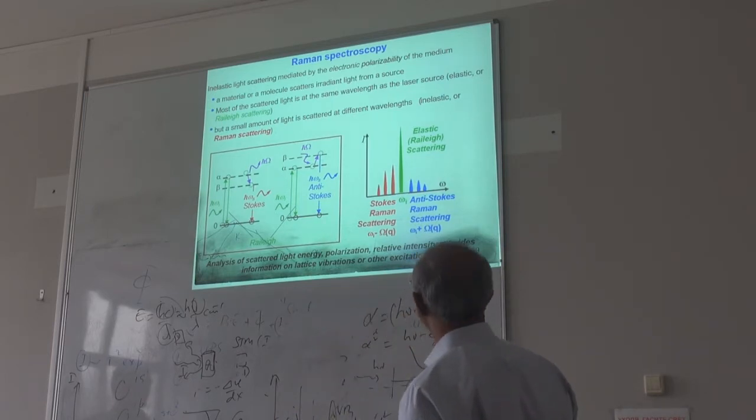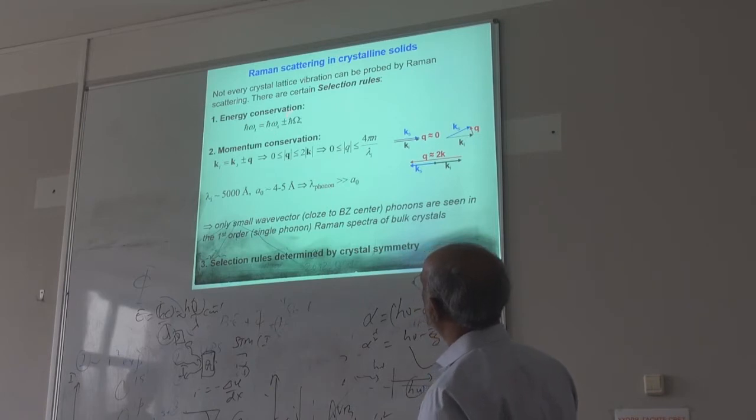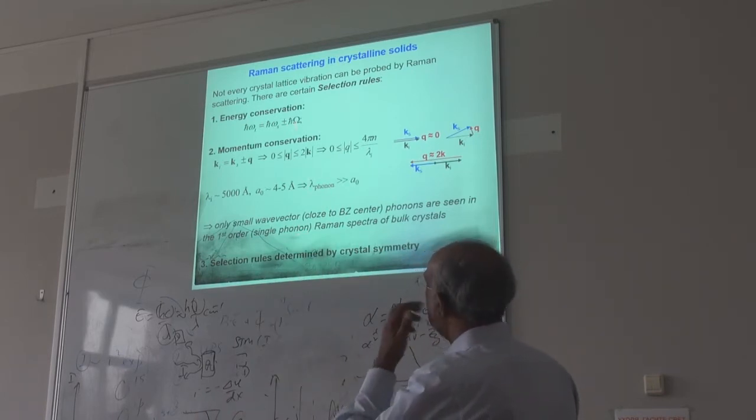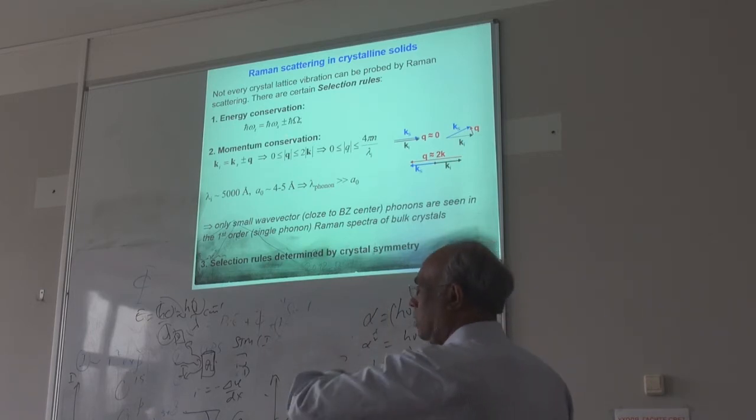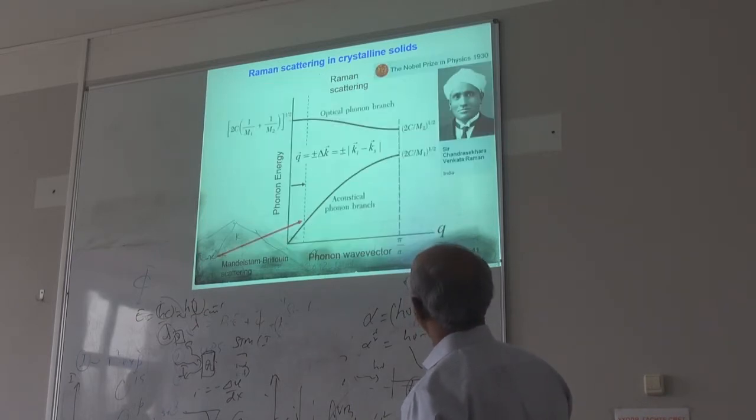So, I will go through that one. This explains how the phonons are created. So initial one, this is the scattered one. Plus means you create a phonon, minus means we call it annihilating the phonon. Right? So depending on that, you can get differences in your lambda.